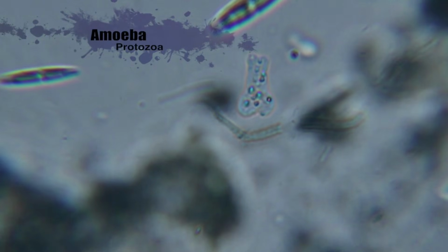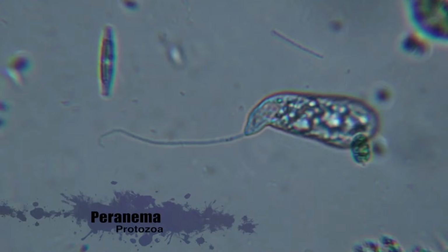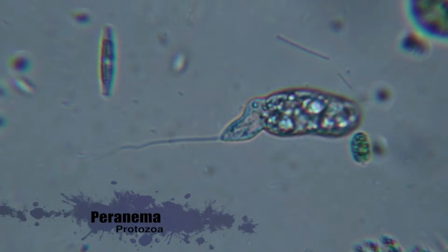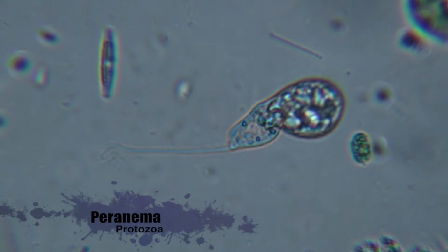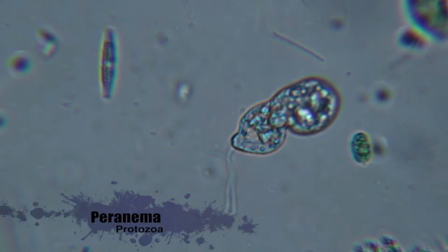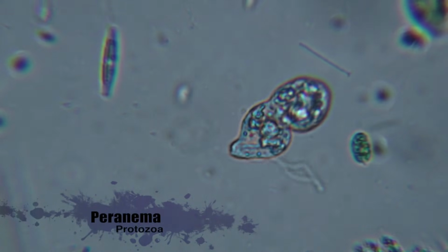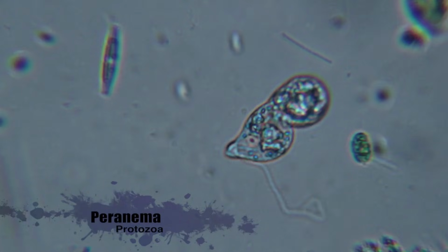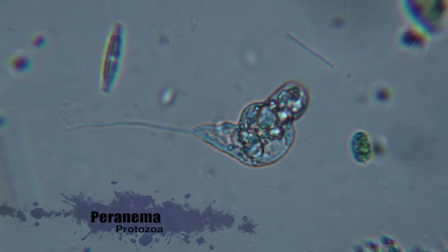This is another type of protozoa, an amoeba. It doesn't have cilia and it moves by oozing itself through the water. Peranema is another protozoa that also oozes through the water, but it has a flagella on its front, which it looks like it's using to sense its environment, and it also can use this to pull itself along through the water.